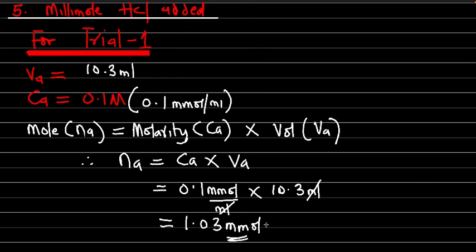So that is the mole of this one. Fortunately, it's already in millimole, so we don't have to convert anything again. So this is 1.03 millimole.